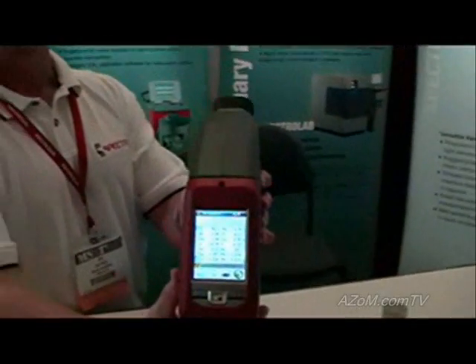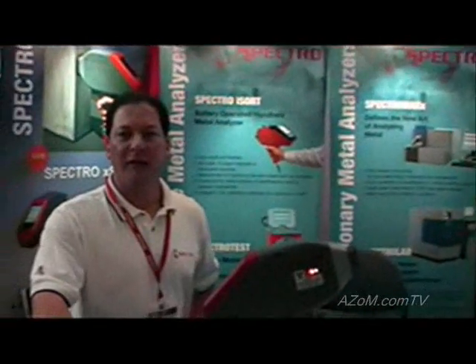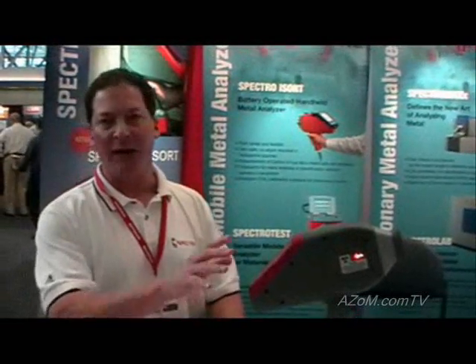What are the typical applications for these instruments? Typical applications are usually scrap yards — sorting scrap stainless steels where they have no idea what's coming in, so they're just jumping in the trunk and doing quick analysis. Also, you can use them in steel mills when doing stainless steel, just double-checking product going out the door. Finished products where they don't want to see a burn mark left on the piece of material they're testing — it's totally non-destructive.